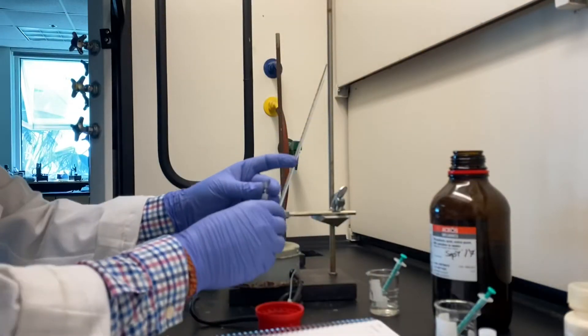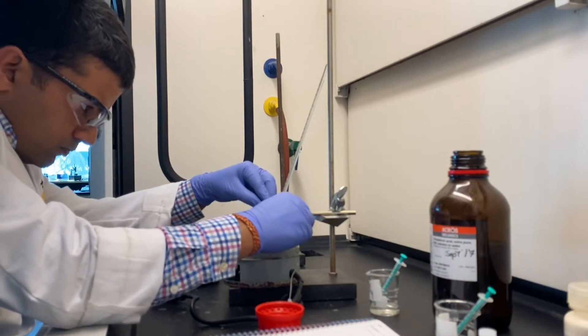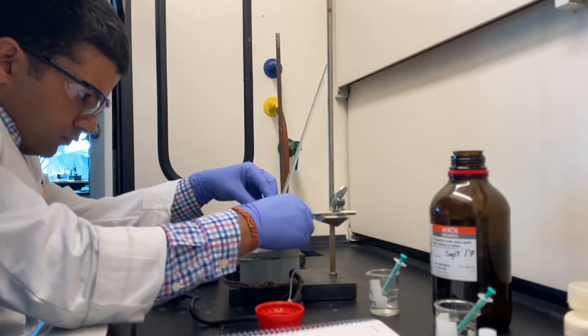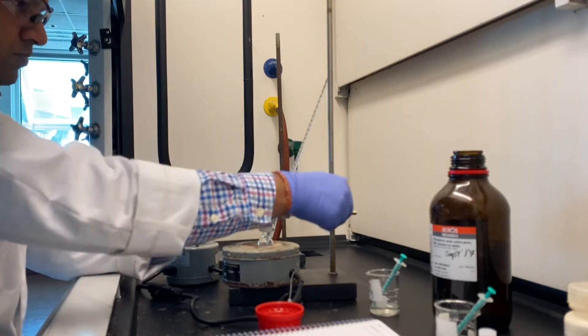Once you have added all the starting materials and catalysts, place only the bottom part of the Hickman still into the preheated sand bath. Make sure you take out your funnel as well, because it's plastic and it will melt.